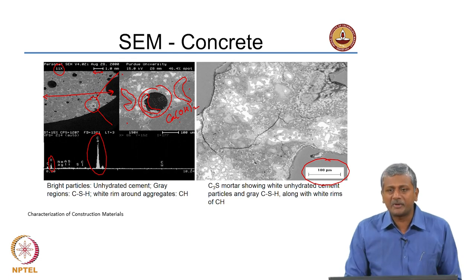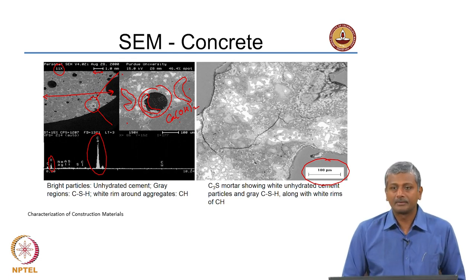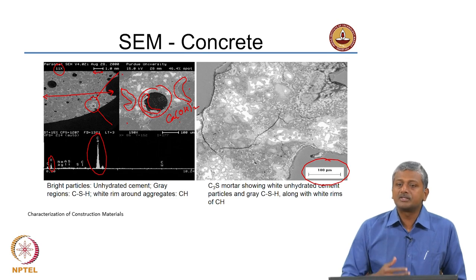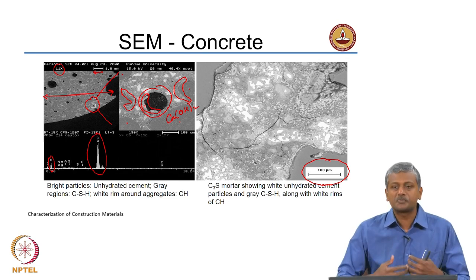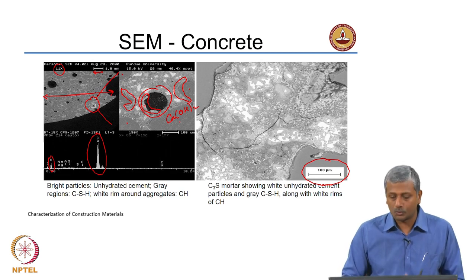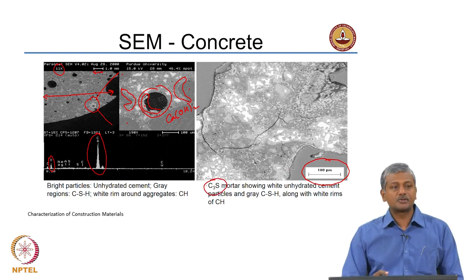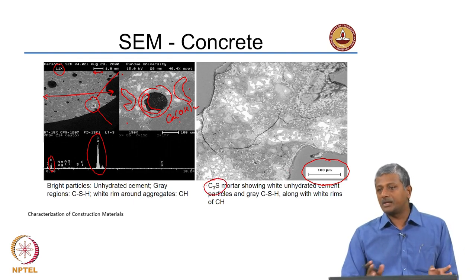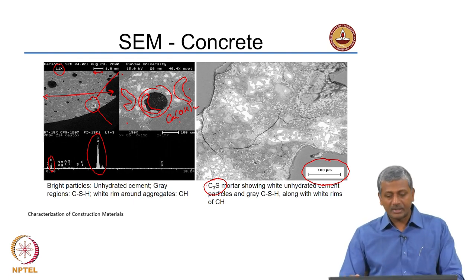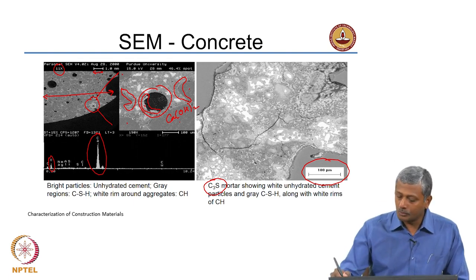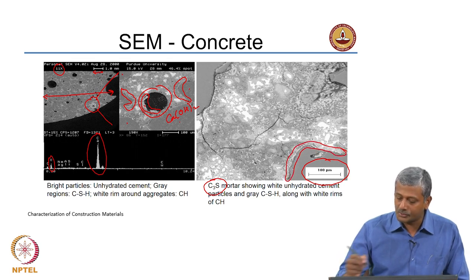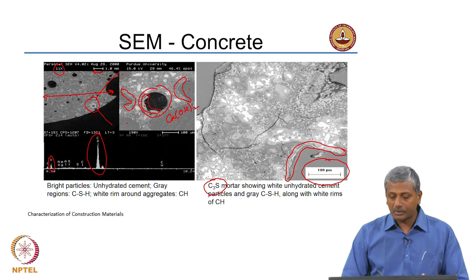Why does calcium hydroxide want to grow in that space? Because of what happens in the interfacial transition zone — there is much larger porosity available at the ITZ, so there is more space for crystalline material to grow. The image on the right is taken from a C3S mortar, meaning there are no aluminate phases. You only have C3S reacting with water to produce cementitious hydrates. Note the level of light grey around the aggregate — that is your calcium hydroxide.